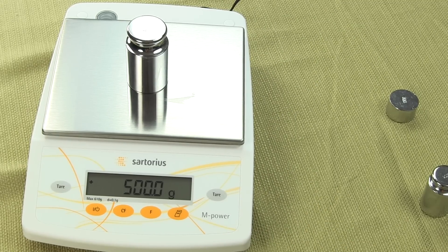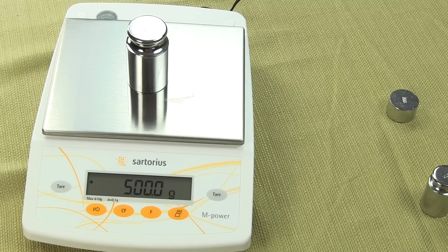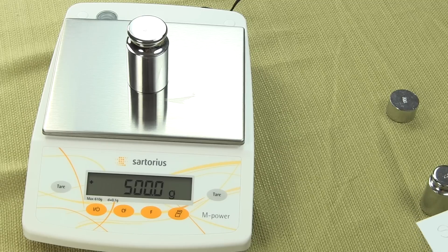None of these balances have the weigh-below hook. There's no way to suspend an item from beneath the balance for any kind of weigh-below specific gravity — that function is sometimes used when weighing hard magnetic materials. You'll find the weigh-below feature in the more advanced series. If you go up to the next step, look at the Sartorius ED series or CPA series.